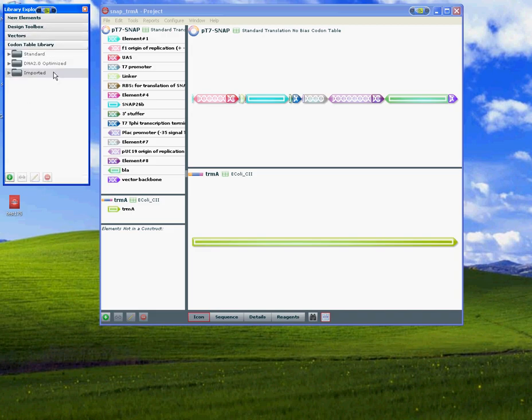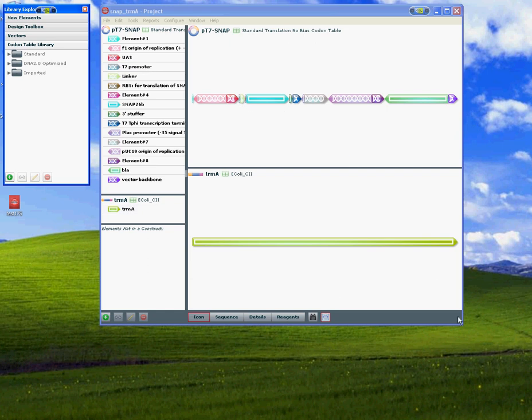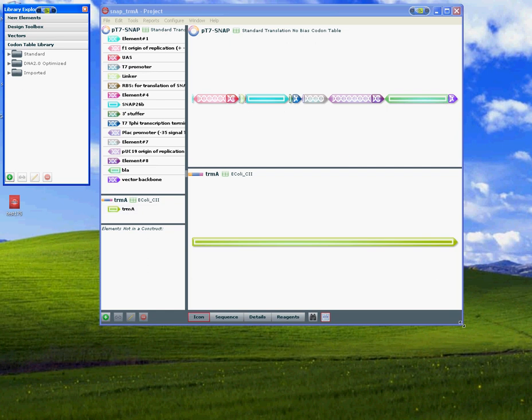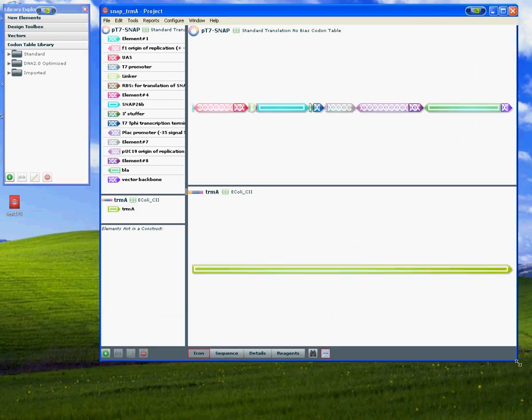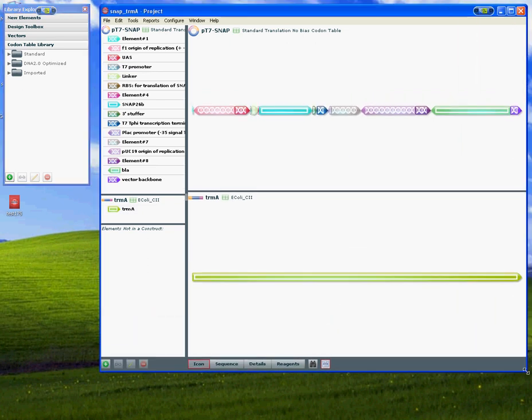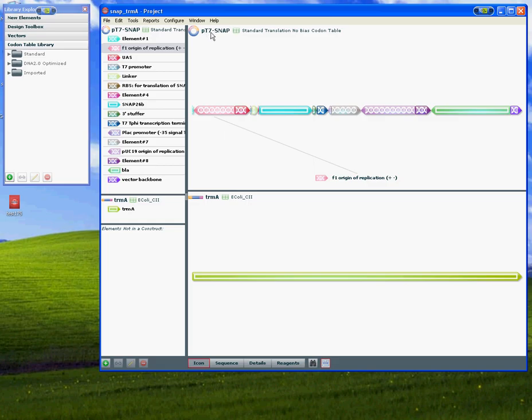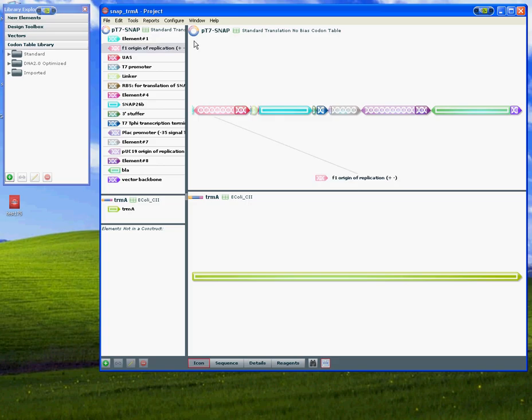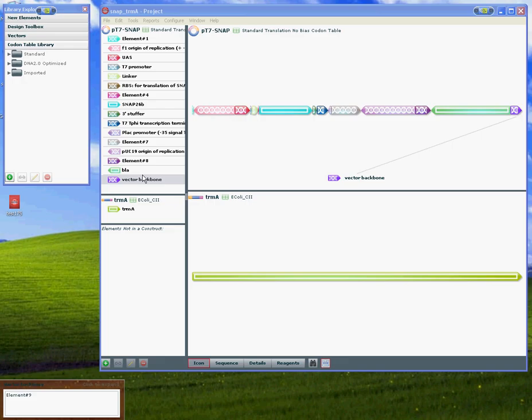On your right-hand side you'll find a workspace. In this example we have two constructs: one is the T7 snap vector, one is the TrimA gene. The T7 snap vector is built from about ten different elements, whereas the TrimA gene is just a single element.